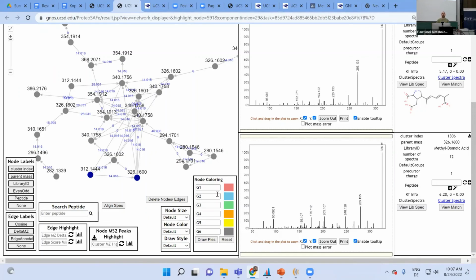Yes. Exactly. And then you have in your feature table the different columns for your samples. Then you will group them downstream, calculate a mean or average, and then you would build the ratio. And some of that we will do in the univariate analysis tomorrow with Philip. But that happens downstream. Right now, let's see this as a first exploration.